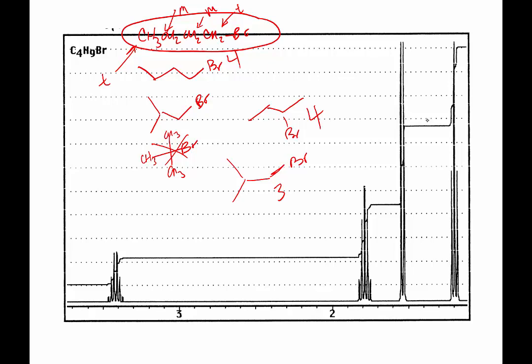Okay? So the whole idea here is that the coupling patterns are telling. We started that. Because I'm going to go back to the fundamental 3 things that we have to do with the spectrum. Number 1, chemical shift tells me that this is attached to the bromine. It tells me for those peaks, the farther to the right, the farther away I am from the bromine. The integration tells me the group. CH, CH2, CH3, CH3.